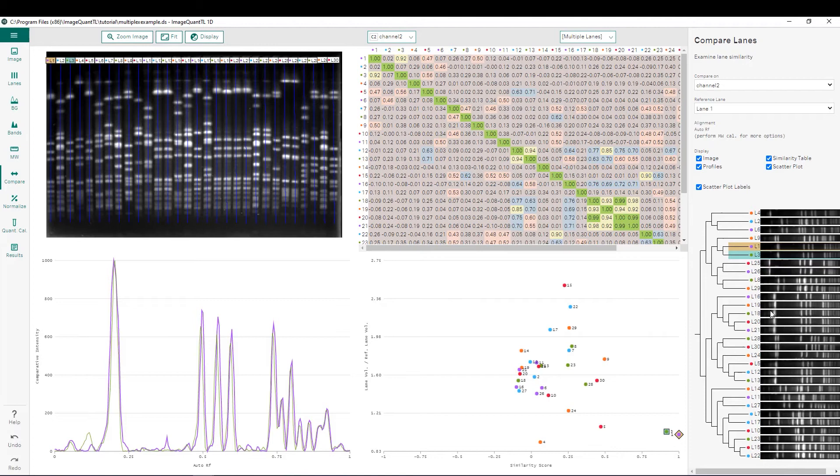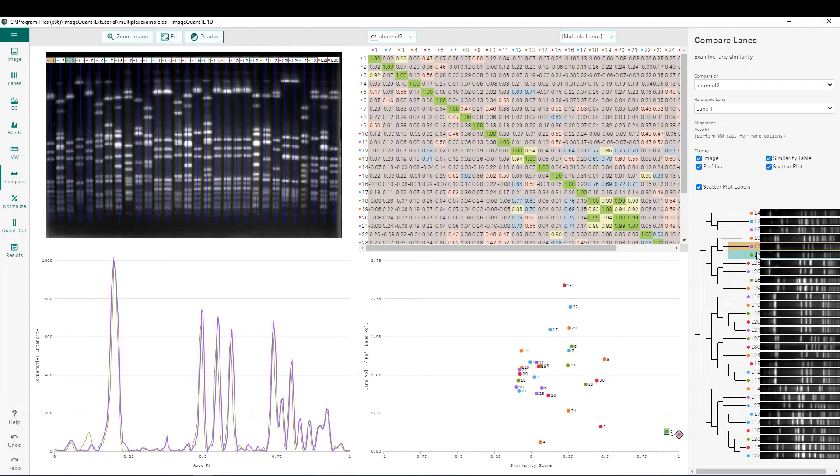To the far right we have a dendrogram which groups our different lanes by how similar they are to each other. We can see lane 1 and lane 3, which are compared in the intensity profiles over here, grouped very similar to each other because their profile is very similar.